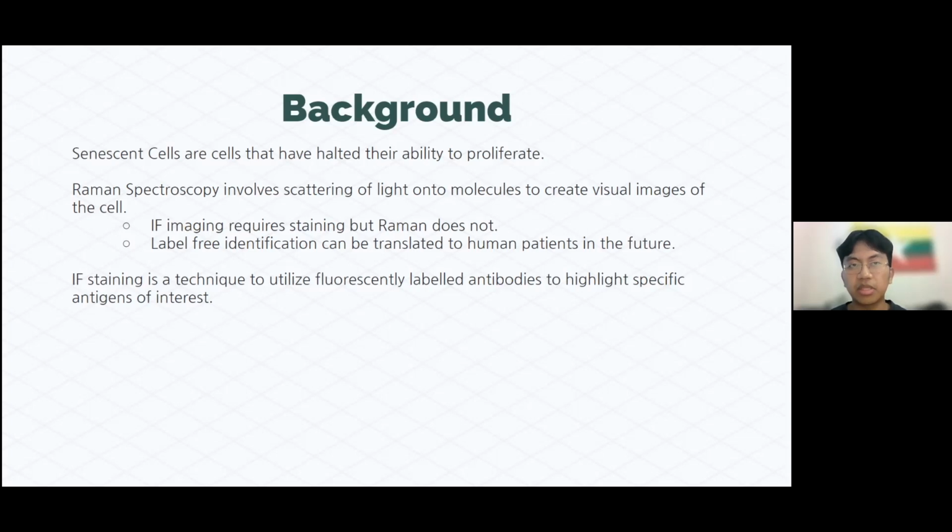And from the Raman spectra, you're able to create images with its label-free nature, which can be translated to human patients in the future. And IF staining, which I utilize within my methodology, is a technique to utilize fluorescently labeled antibodies to highlight specific antigens of interest.